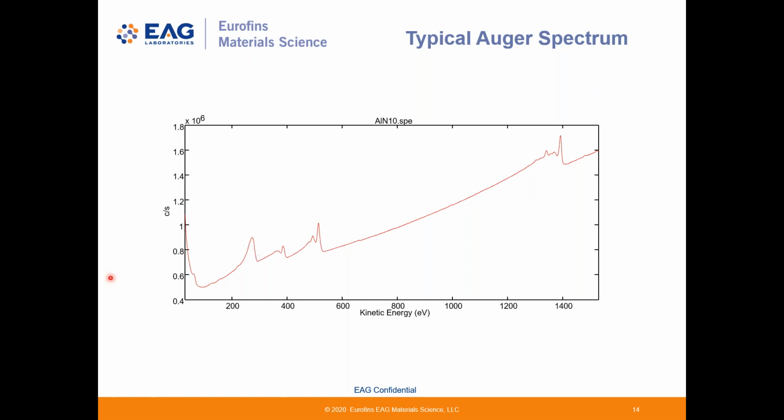So what is usually reported is the derivative of this spectrum, and mainly for historical purposes, because older analyzer designs had an even higher background, making the peaks barely visible. With the differentiated form, the peaks are enhanced. The background is level due to the gentle slope of the background being more or less constant.